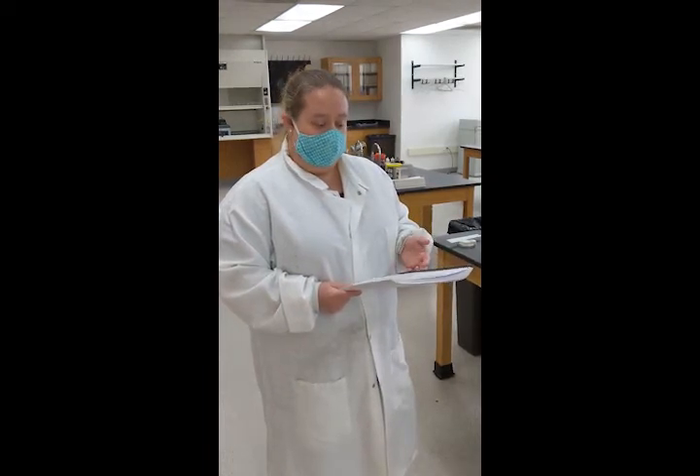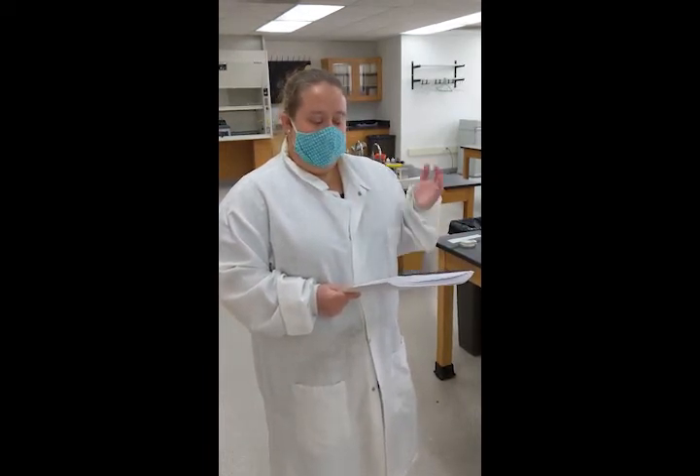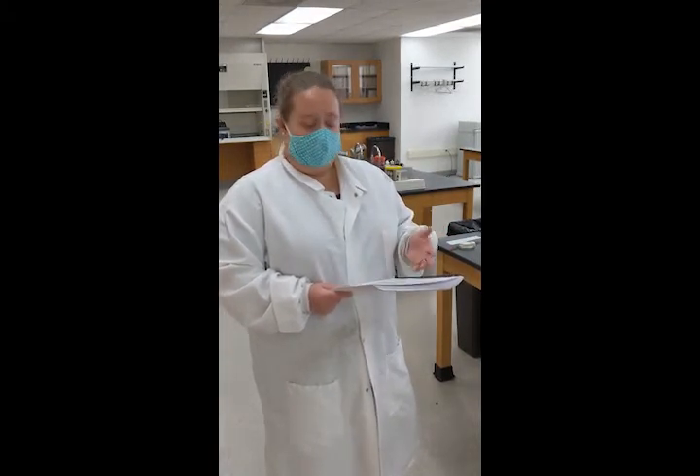If you have any cuts on your hands, make sure that you keep them covered. If you need to, ask your lab instructor for a band-aid or wear gloves during class.